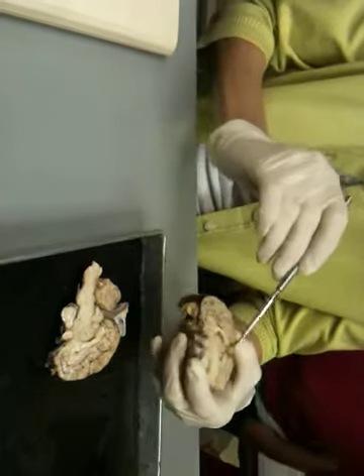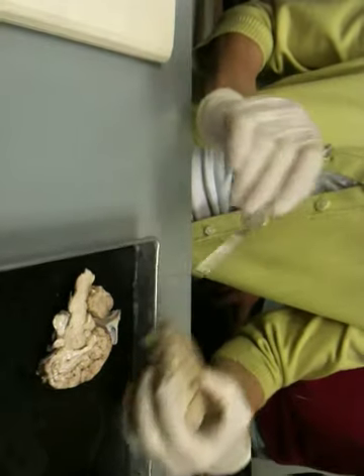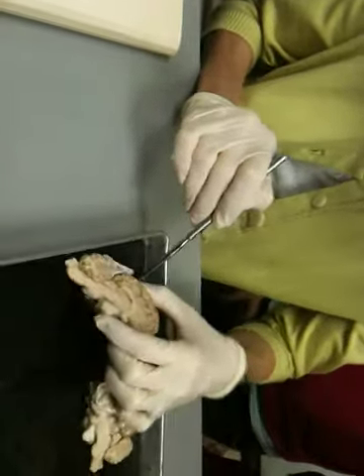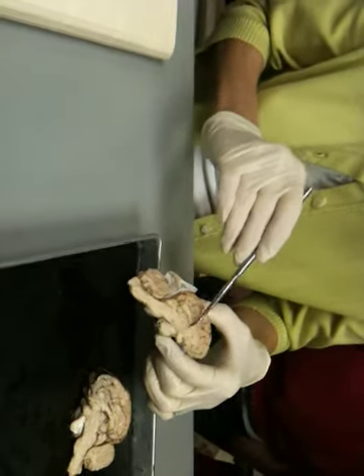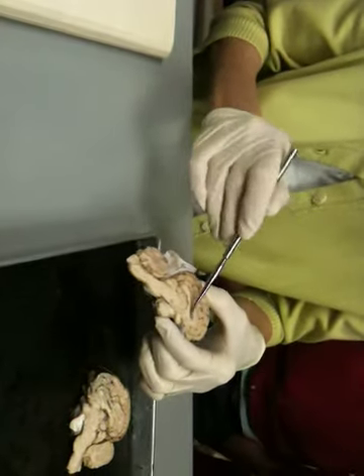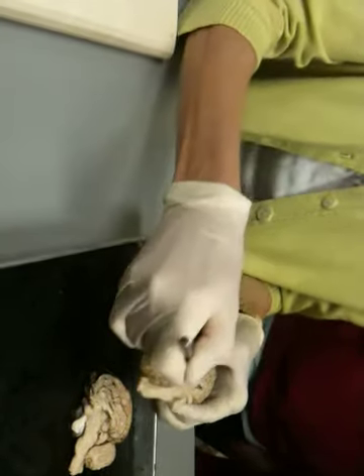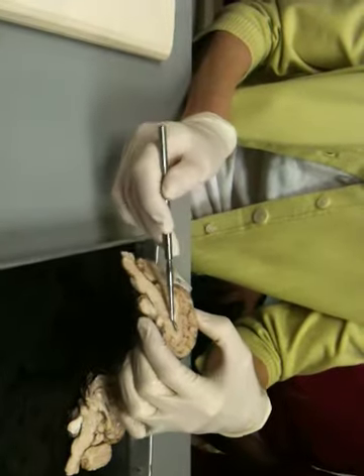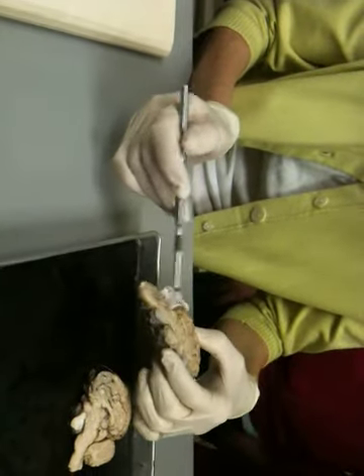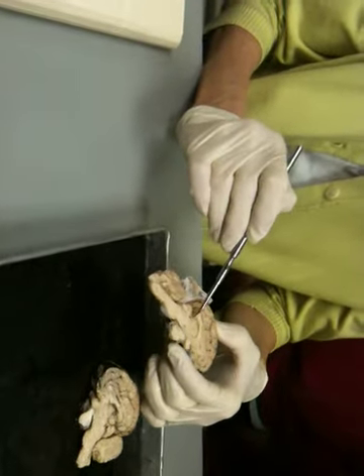Okay, so this is the corpus callosum. Yeah, kind of hard to see on the sheep brain. It's C-shaped, and the tract that goes down is the fornix. Right between them, this thin membrane here is the septum pellucidum. Okay, septum pellucidum. So again, thalamus, hypothalamus, pituitary, pineal gland.